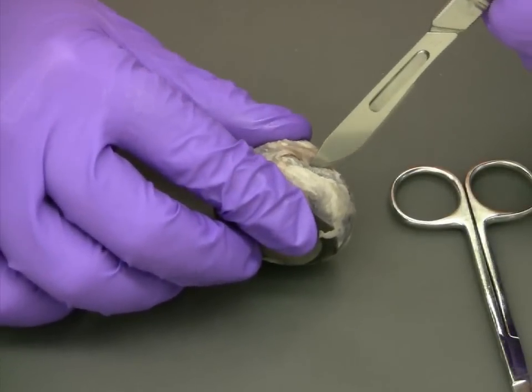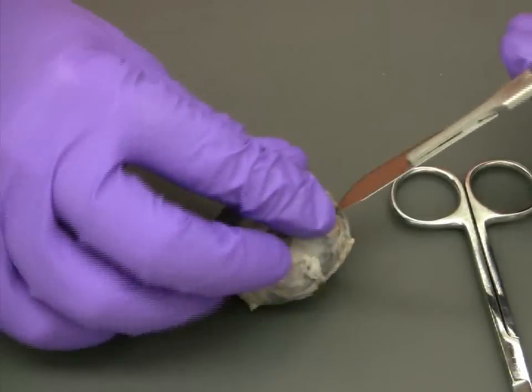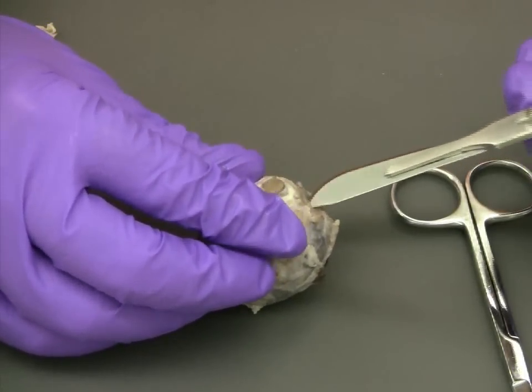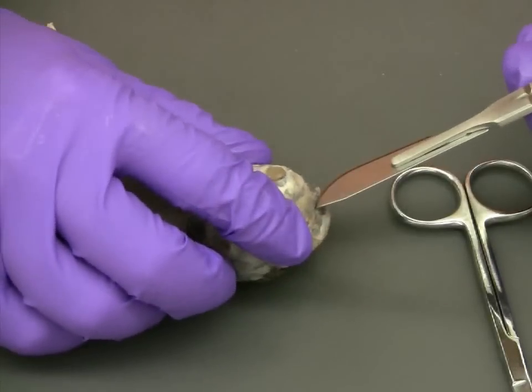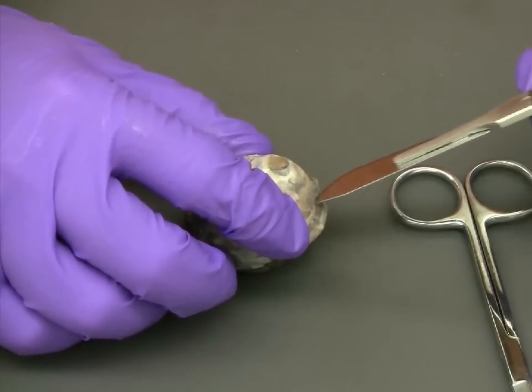First, carefully press into the sclera to make a very small initial incision. Then, all you need to do is make a series of short cutting movements to widen that incision, just enough to allow your scissors to get under the sclera.